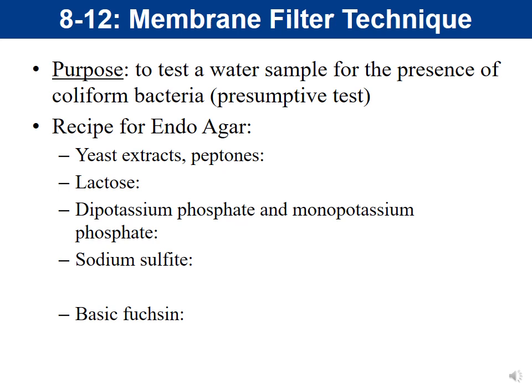And remember that the purpose of our membrane filter technique is to test a water sample for the presence of coliform bacteria. And again, this is a presumptive test. So the endo agar alone is presumptive. It's not going to be able to tell us with 100% certainty whether or not coliforms are in the water, but it does give us about 95% confidence.